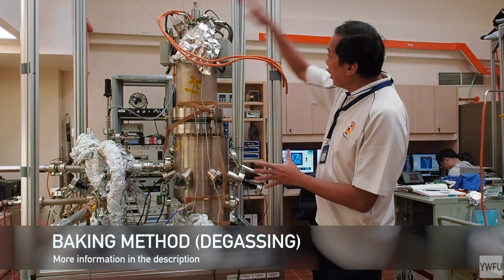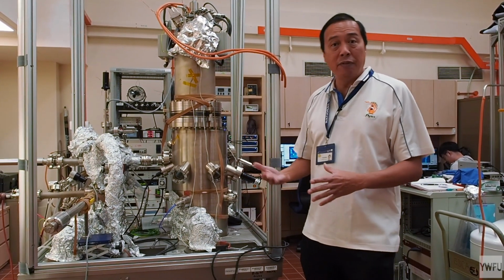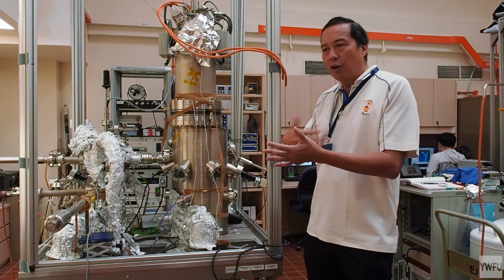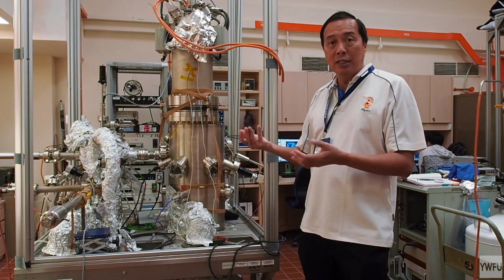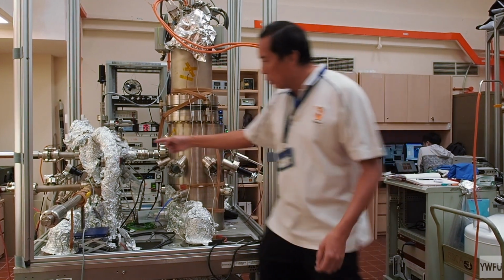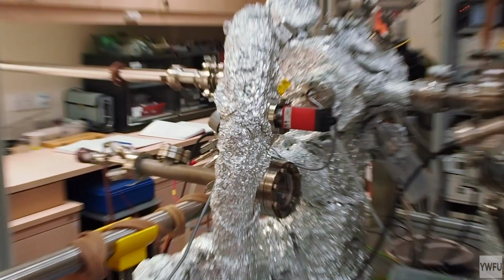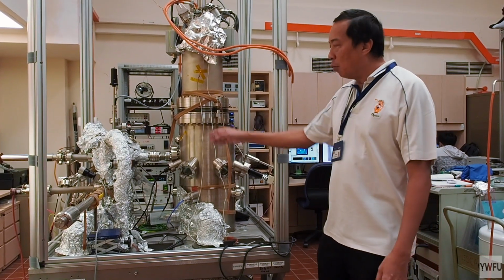And we can actually cover this whole system with shields and heat it up to 150 degrees centigrade. The reason we do this is to accelerate the degassing of molecules out from the whole system so that when we turn off the oven, it will cool down and reach ultra-high vacuum. And sometimes we just want to heat up certain parts of the system, and that's why we use this kitchen foil that you find in your kitchen. So they are just normal aluminum foil? Yeah, it's normal aluminum foil.